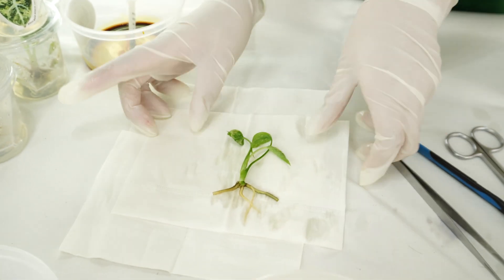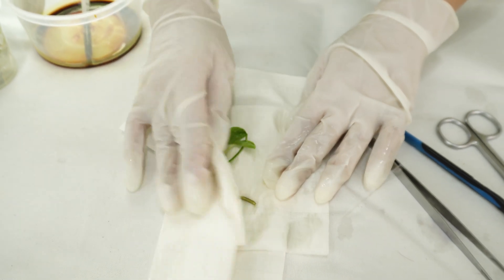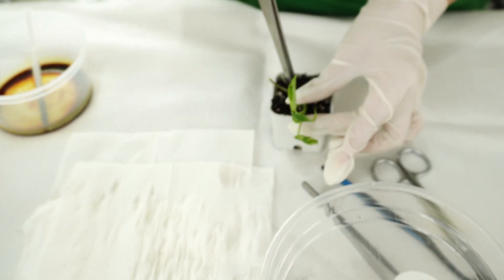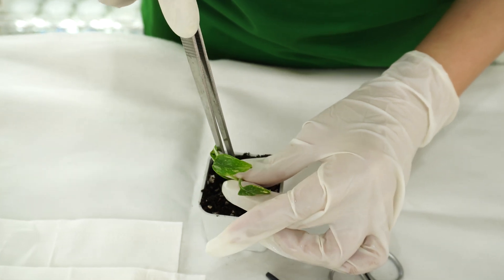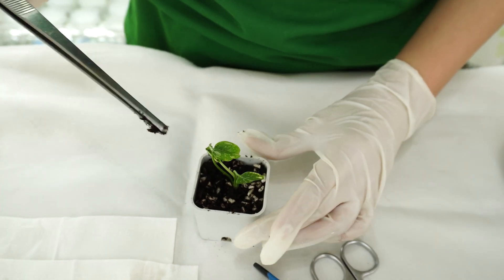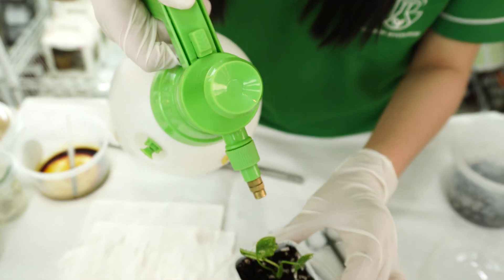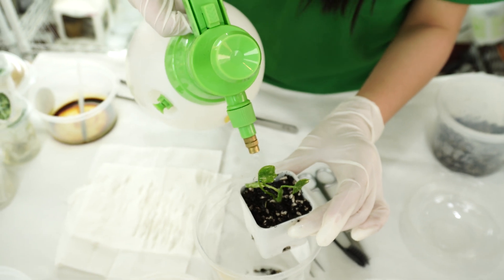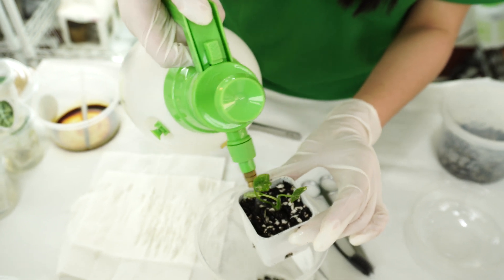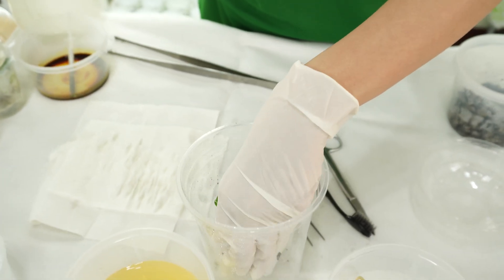Now we're going to put the plant into our little pot, and this little pot is going to be placed inside our dome plastic container or dome plastic cup. We're going to spray a little bit of water into the pot — make sure that you don't spray too much.